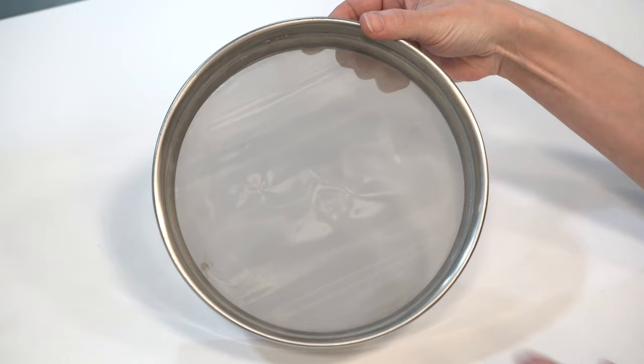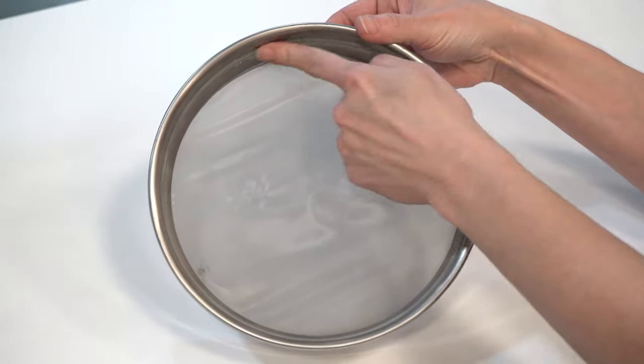Visual inspections are pretty easy to do. You're going to want to check for cracks in the sieve frame and the skirt. Look for holes in the mesh and any cracks in the epoxy.